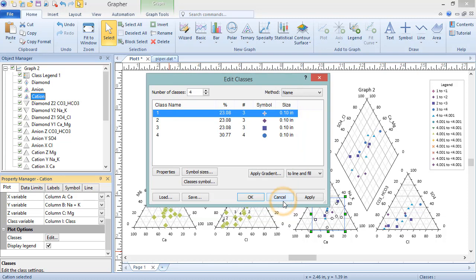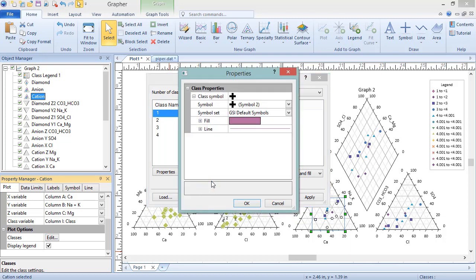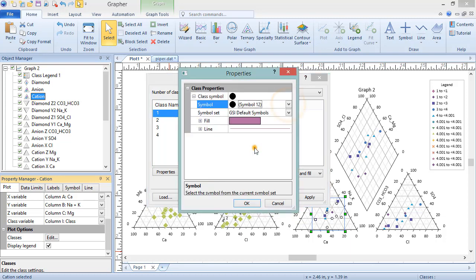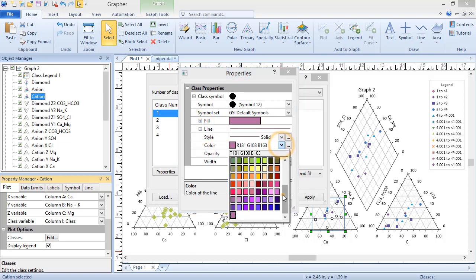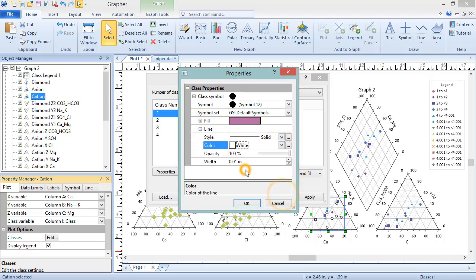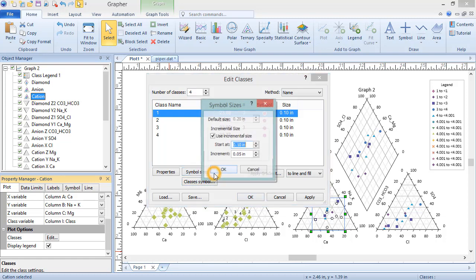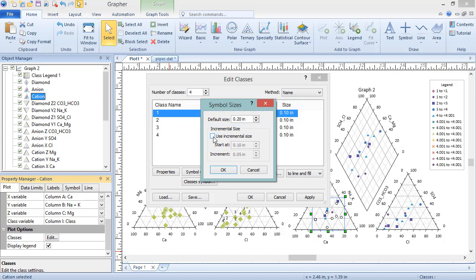Alternatively, edit the symbol properties for all classes by clicking the Classes Symbol button. And edit the size for all symbols by clicking the Symbol Sizes button. Symbols can be all the same size, or they can be scaled from a minimum size at a given increment.